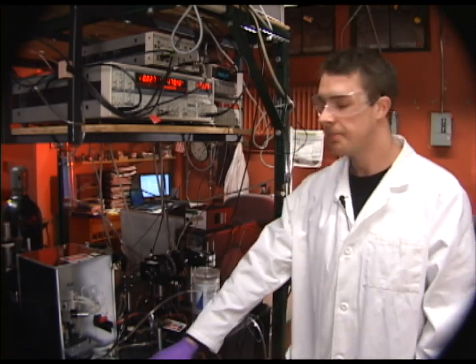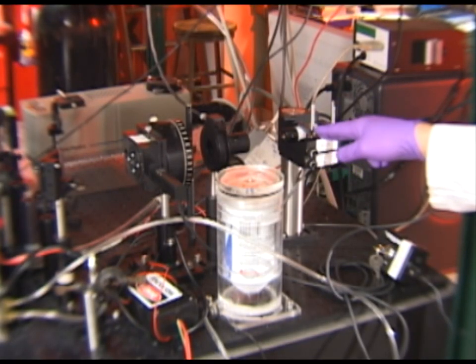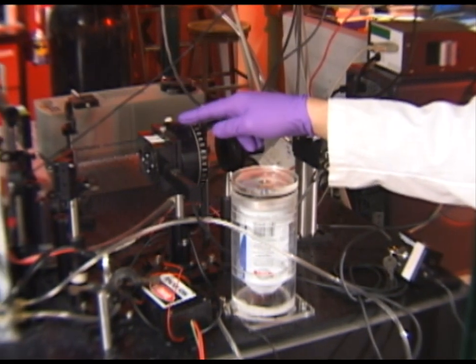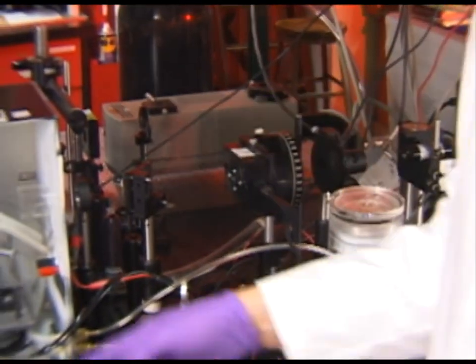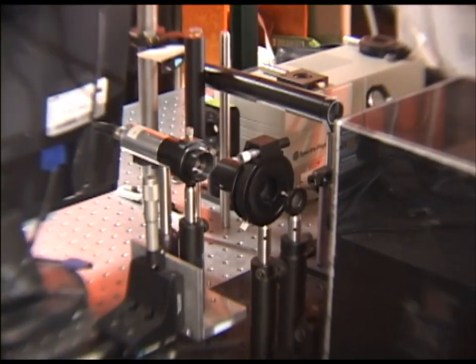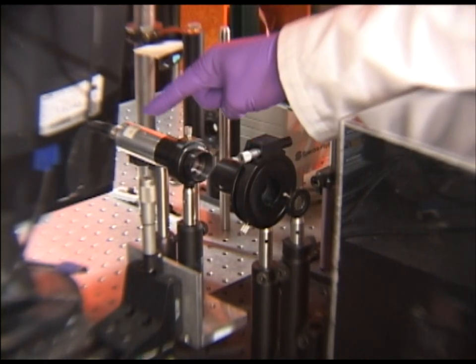Next I'll go over the device setup. The optical setup begins with a 1310 nanometer laser which passes through a polarizer into a compensator and is focused onto the sample on the sample stage. From the sample stage the beam is reflected to a cross polarizer and then into a photodiode.